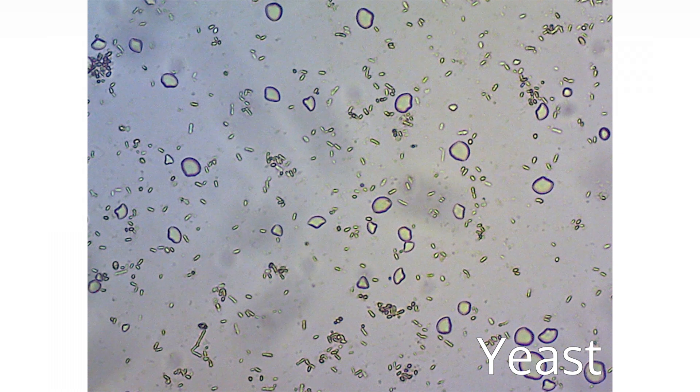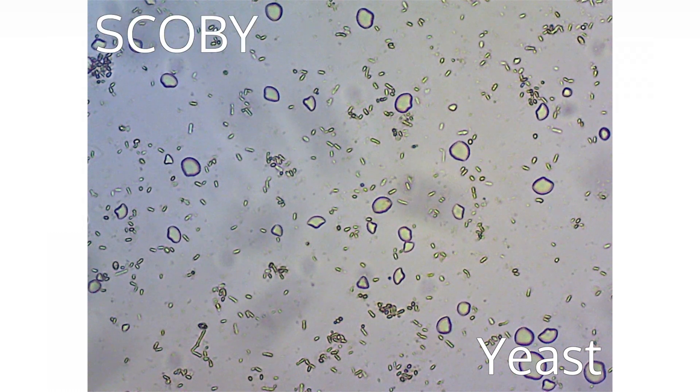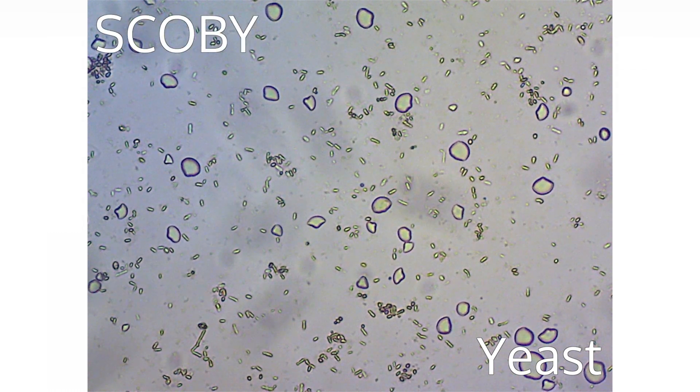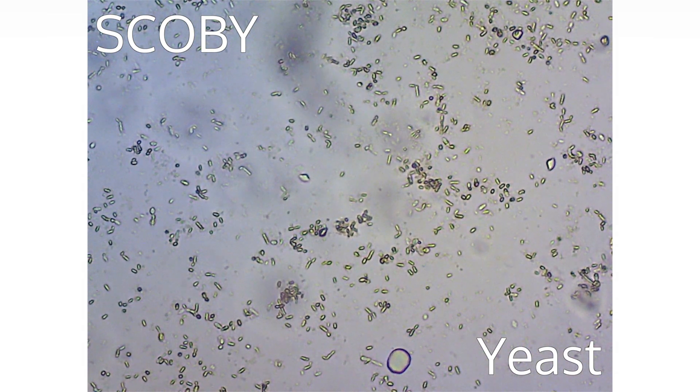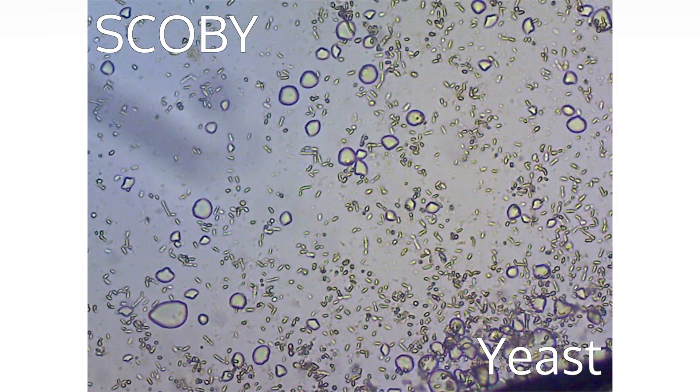Kombucha is made of a yeast and a bacteria culture called SCOBY. SCOBY is a mix of cultures of bacteria and yeast present during the production of Kombucha. The recipe for SCOBY differs between Kombucha brands and types.